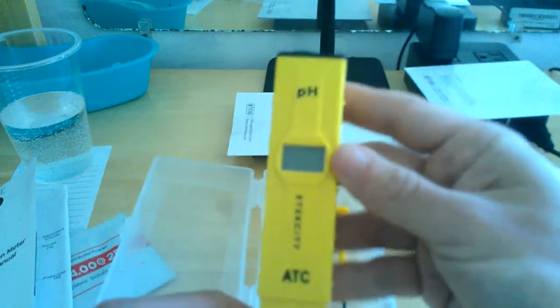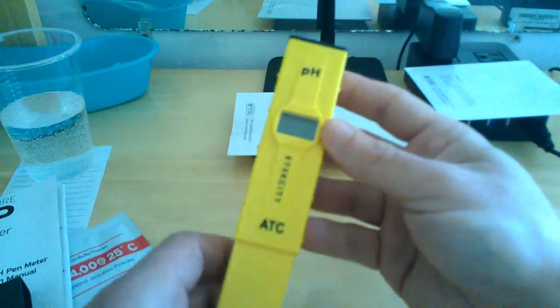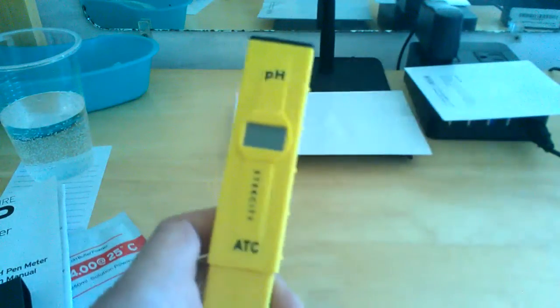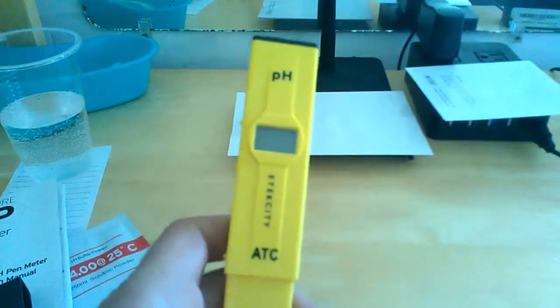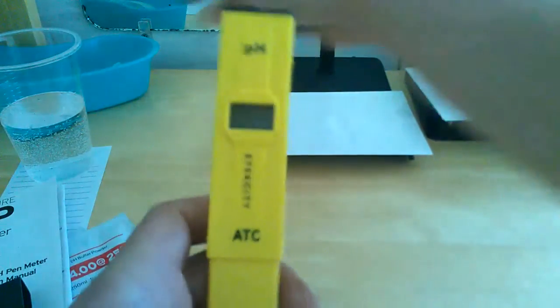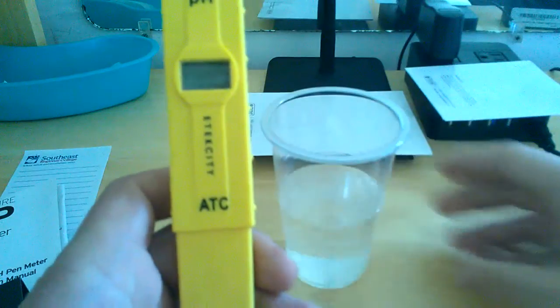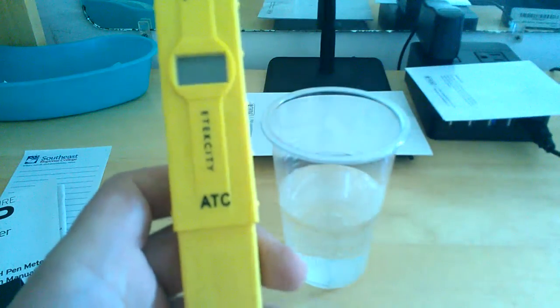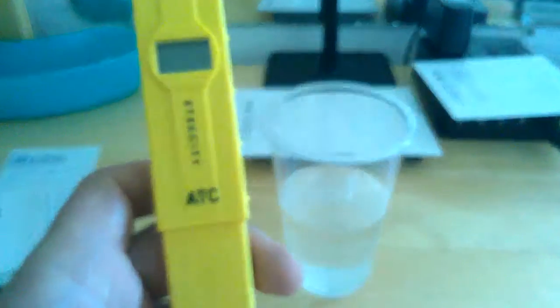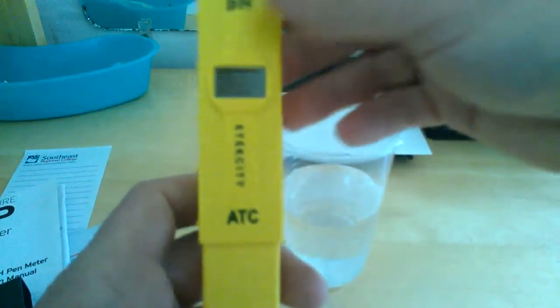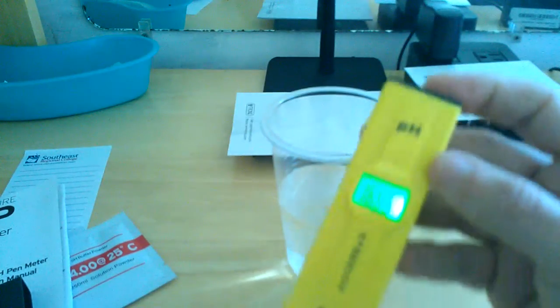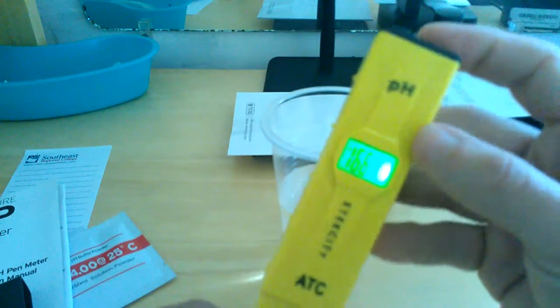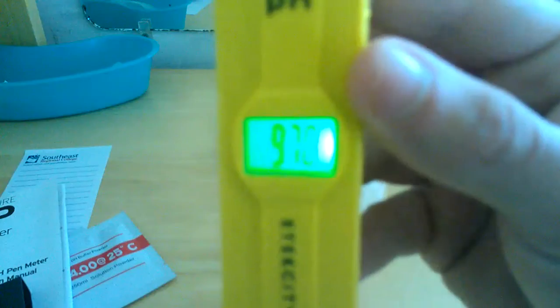I'm going to just give you guys a real quick test here. I've had a glass of water. It's best to test your products at room temperature. So I've left this glass of water out overnight. Actually it's been out for two or three nights now. I think I've got about the right amount of water in there.